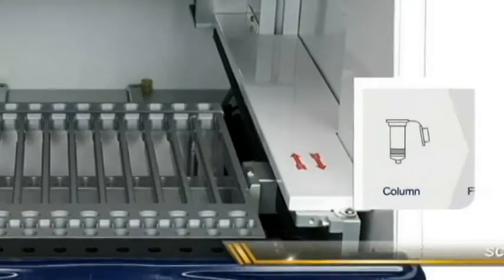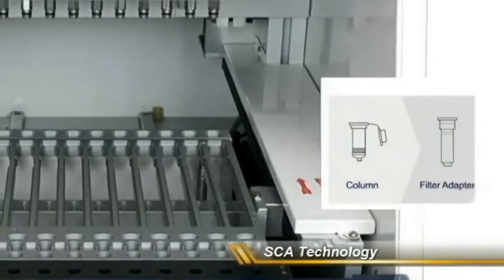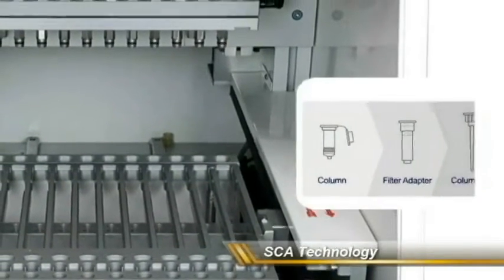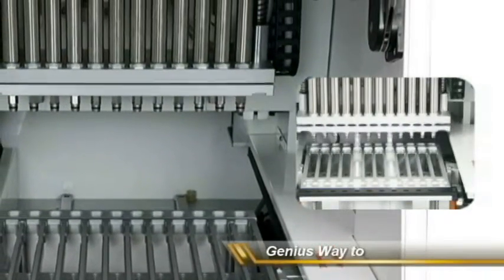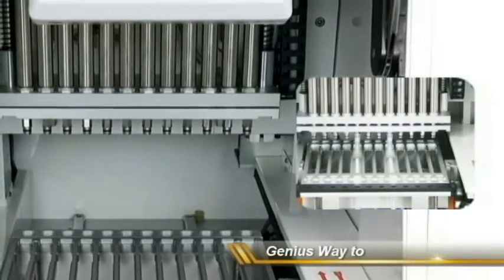To create a centrifuge-free system, we developed the SCA technology. By combining the spin column, filter adapter, and column tip, pressure syringes aspire lysate with maximum efficiency.